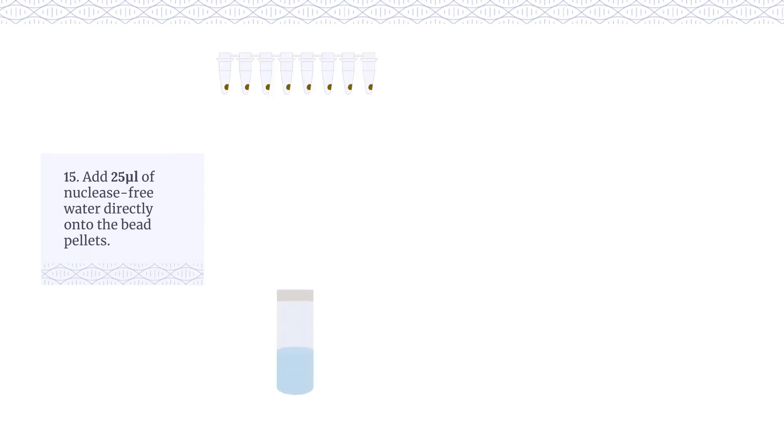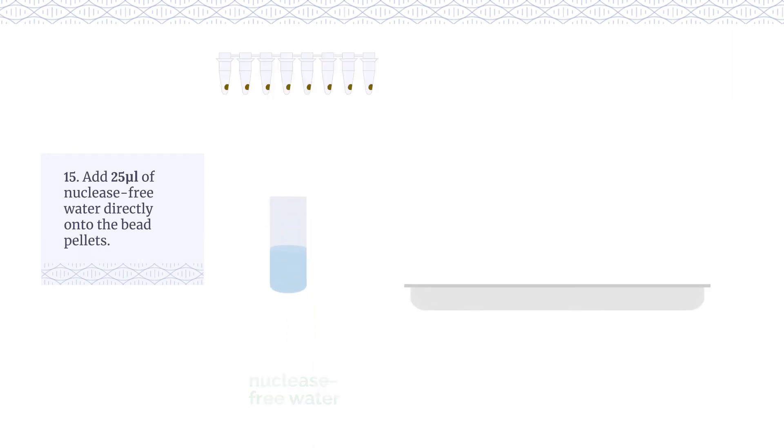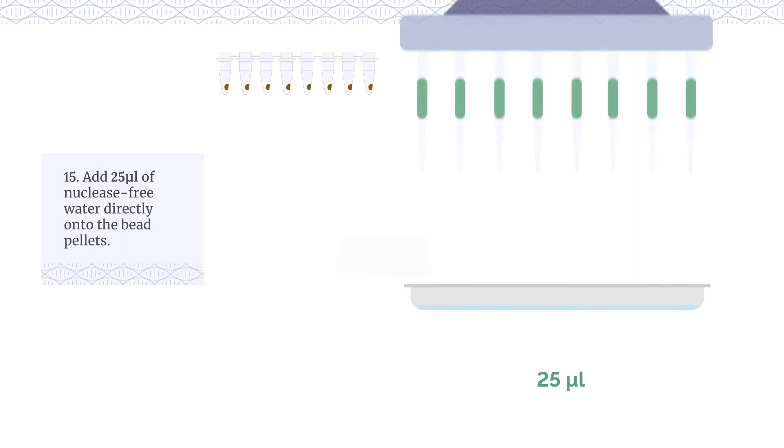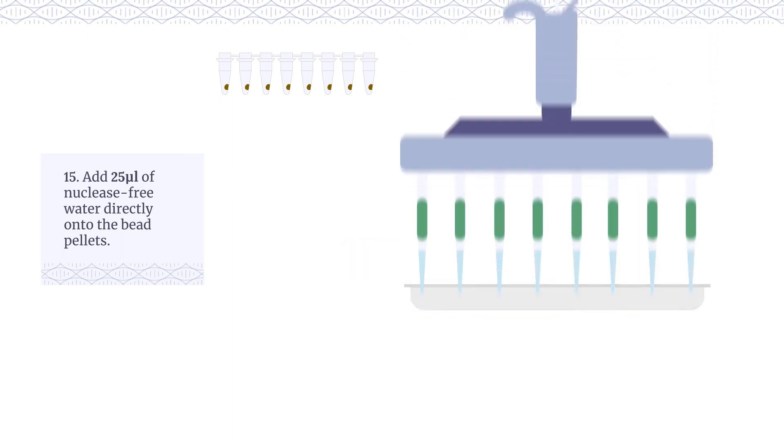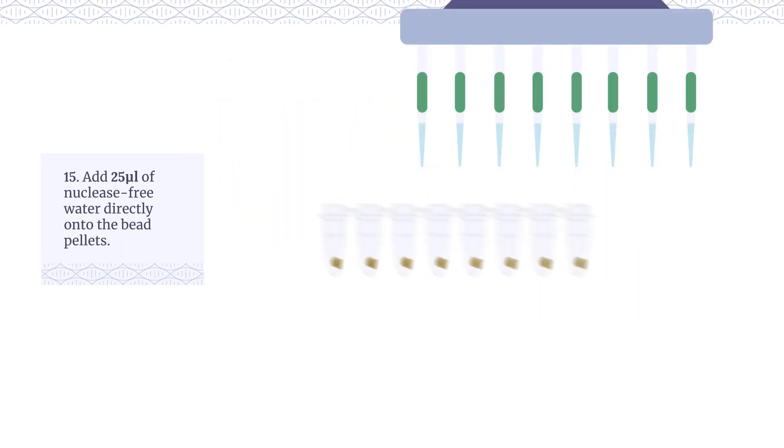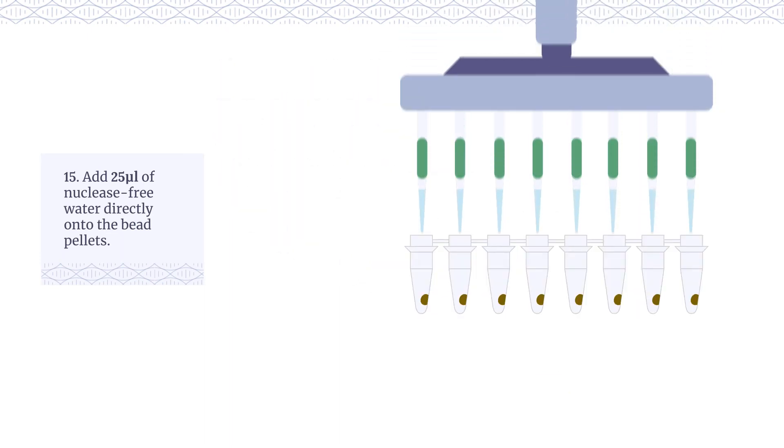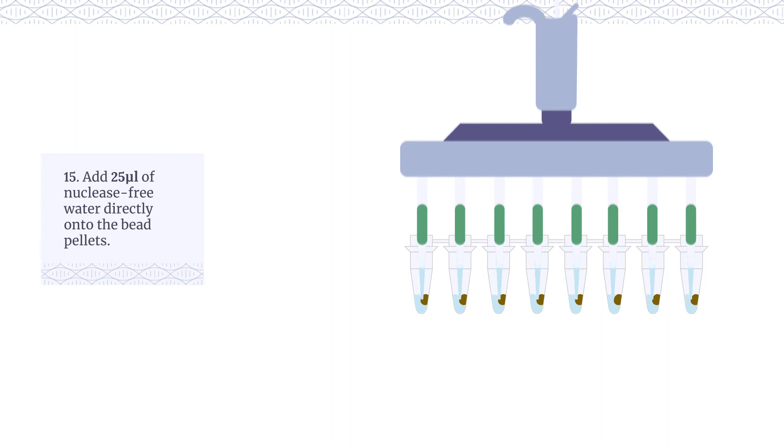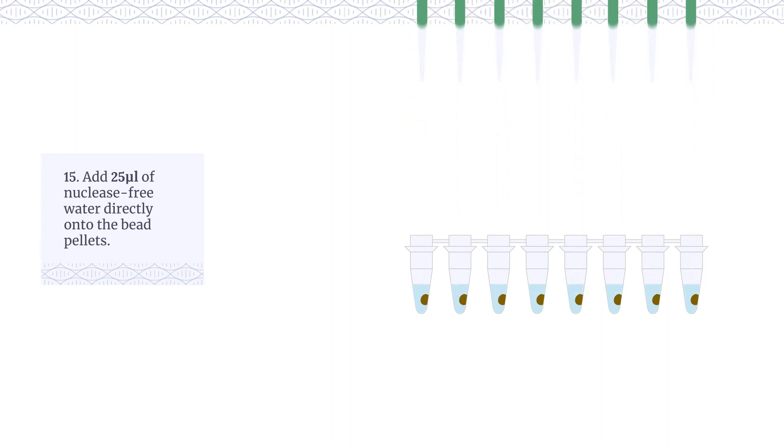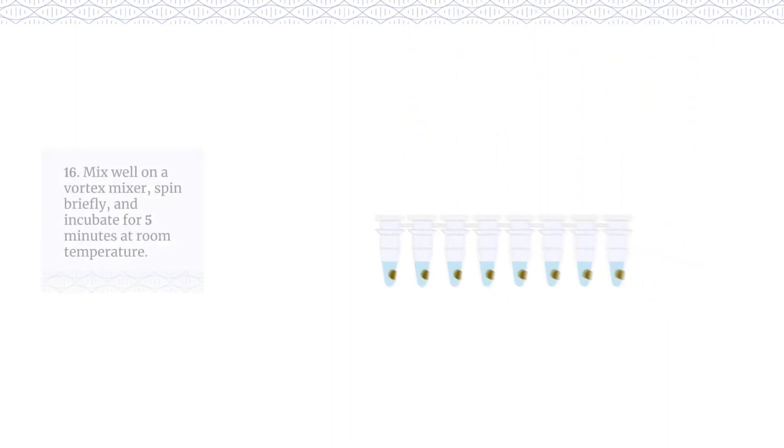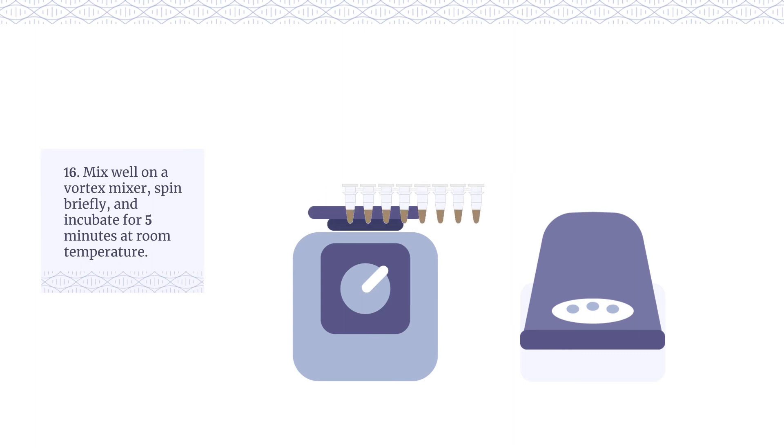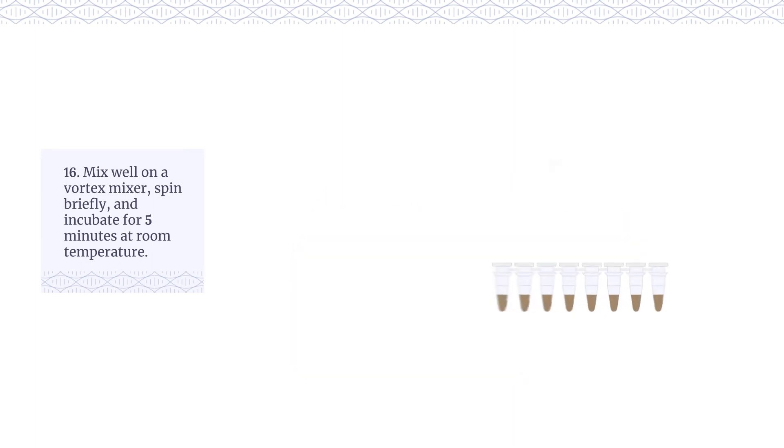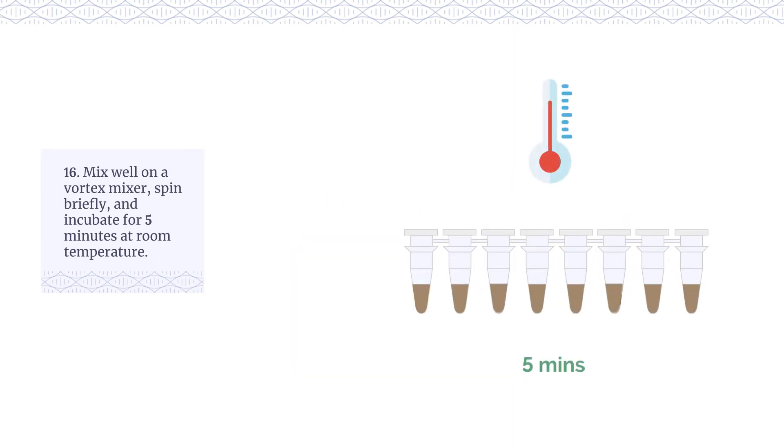Add 25 µL of nuclease-free water directly onto the bead pellets. Mix well on a vortex mixer. Spin briefly and incubate for five minutes at room temperature.